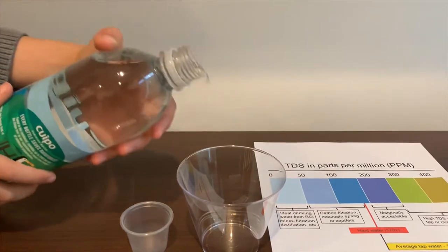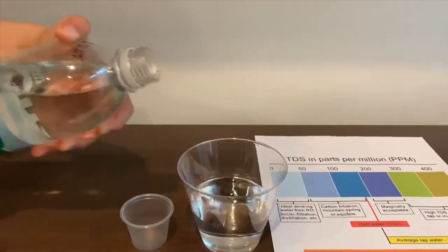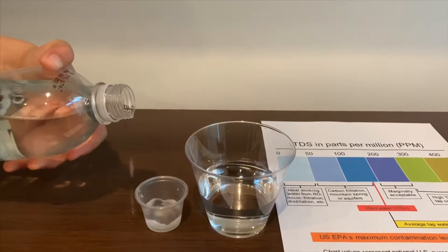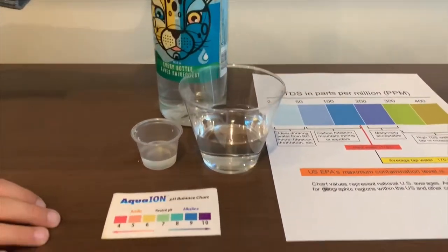Let's pour some water in. First we're going to check the TDS level.